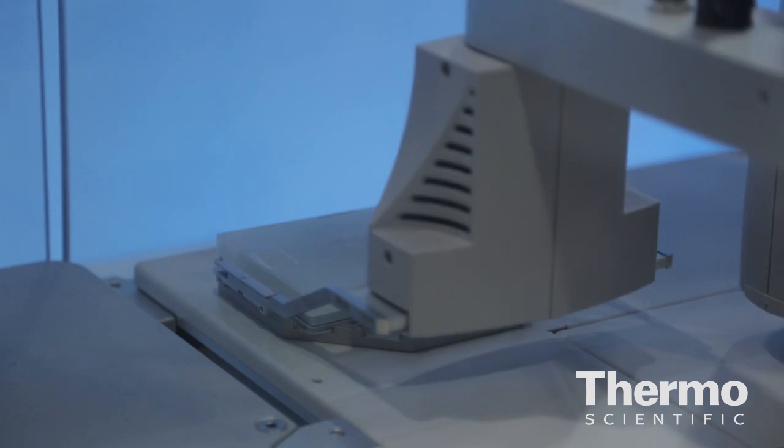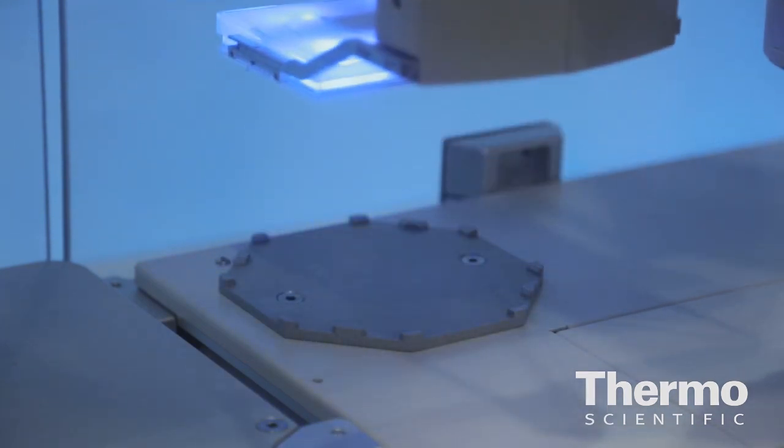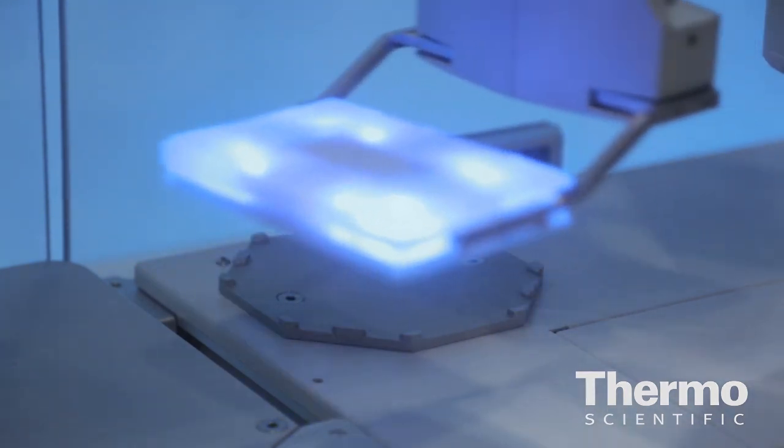The customer also gets some other really cool features that come with it. That integrated re-grip station there changes the stance of the plate so it can go into different kinds of instruments. It can also lid and de-lid plates — they don't have to buy those expensive peripherals; they come standard.